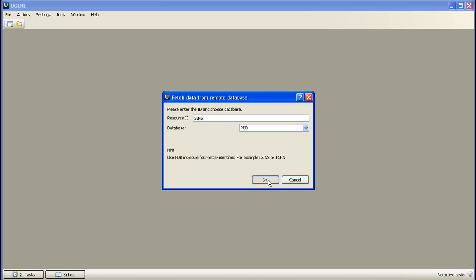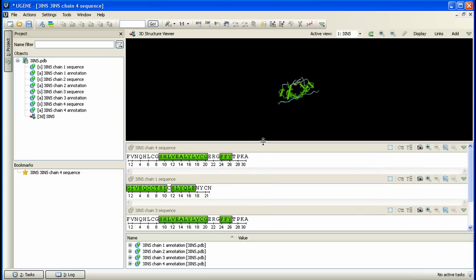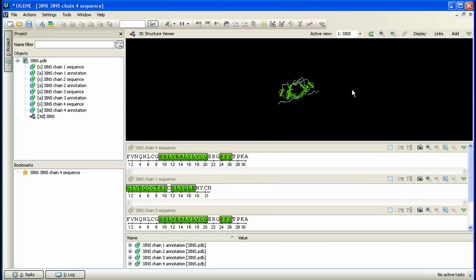While the document is being loaded, the status line reports that the load remote document and open view task is running. Now the document is loaded and its view has been opened.